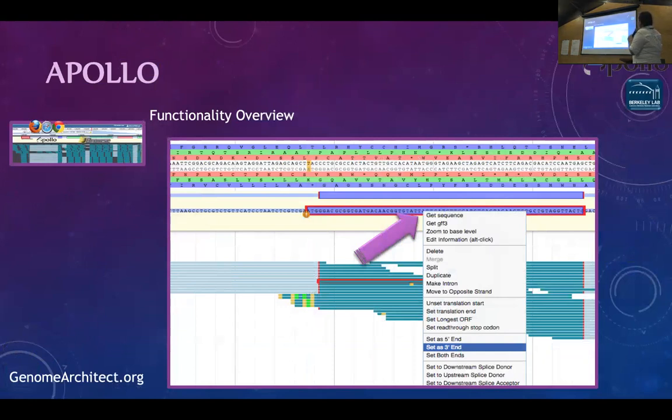In this case, I'm simply giving an example of how I can use, this is again an RNA-seq read down here. This is the part that's being transcribed, and this is just a simulation of how this transcribed part connects to the other part of the read on the other side of that intron, right? You do remember, if it's not being transcribed, then it's not going to show up. So these data actually tell me that this gene model needs to be modified.